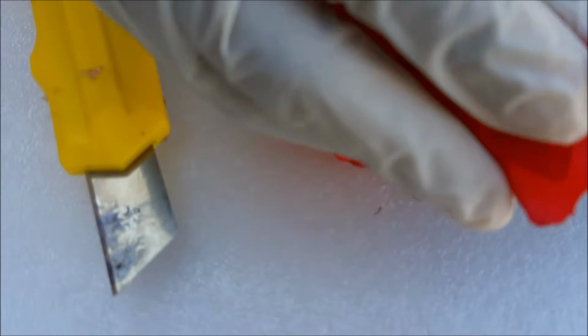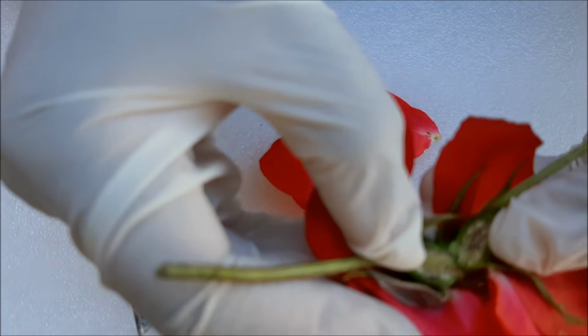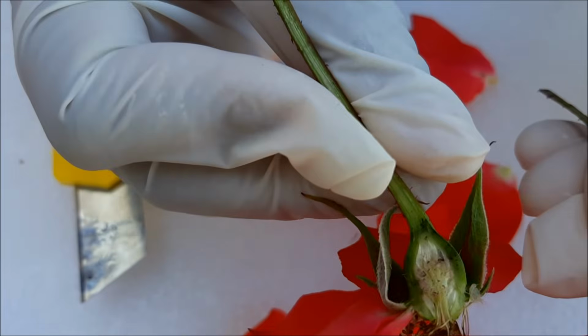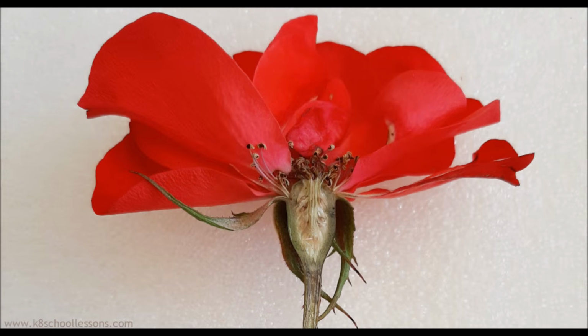After splitting the flower, carefully open it without damaging the internal parts. No need to rush at all. Now, we are ready with the dissected flower. Let's take one of the halves and see what it has to show us. These are the two halves of my dissected rose. This is another dissected flower. It is called gazania or African daisy. This is one of the halves of the dissected rose. Are you ready to see what's inside it?